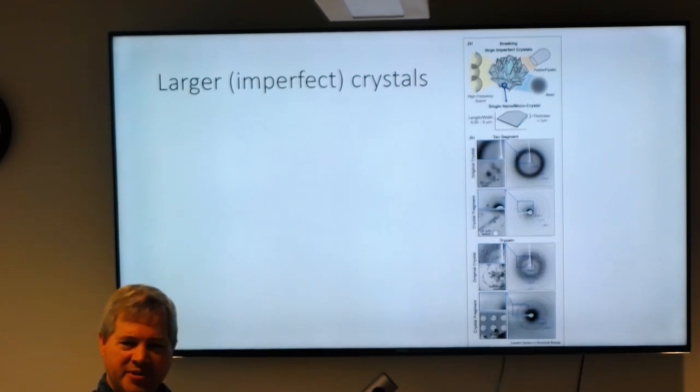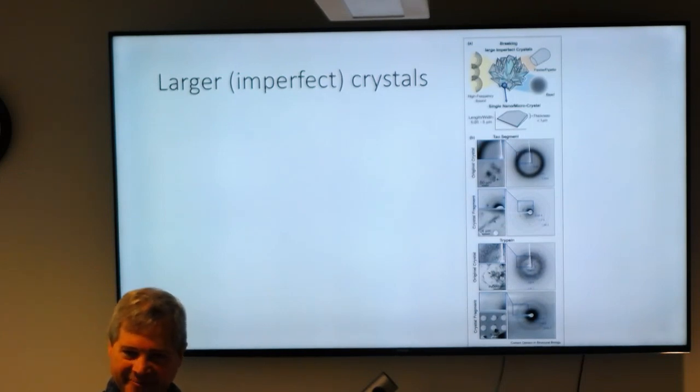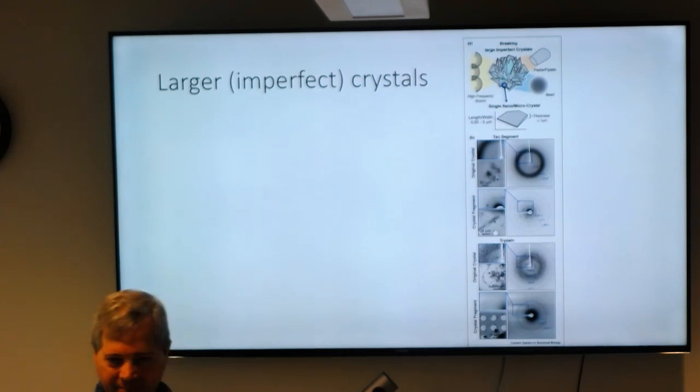It's kind of a weird coincidence. I forgot to mention in the lecture, but this technique came out almost the same time as direct detectors. Maybe a little bit before, I think. But at about the same time, we had 2 techniques that suddenly vastly improved EM.